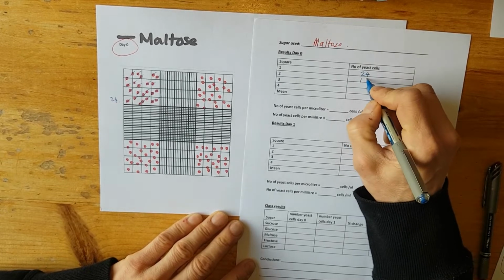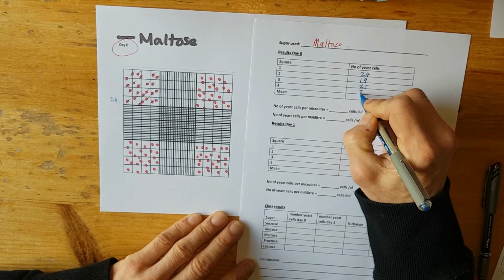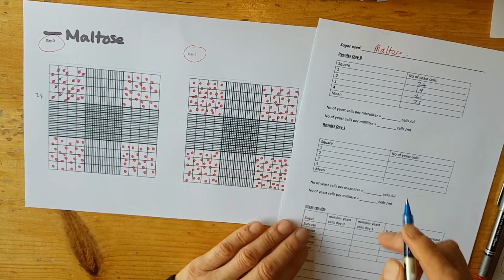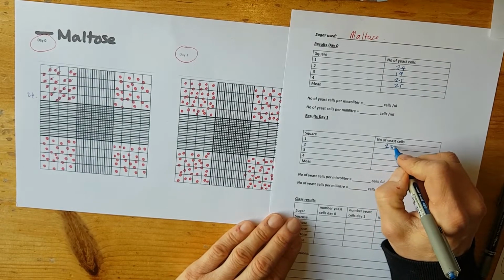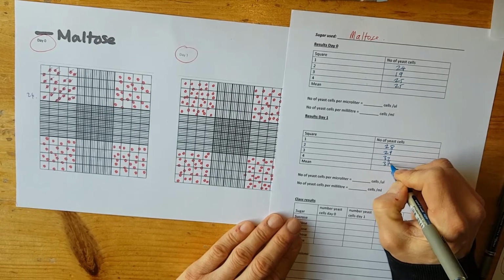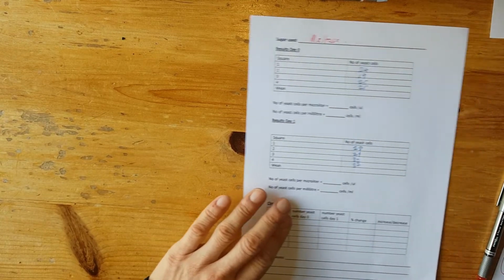I've done 19, 25 and 25 there, and I've also counted these already as well. So I've counted 28, 29, 32 and 37 across here. So I've done all those counts. We can get rid of those.